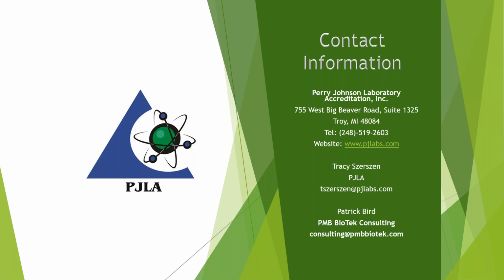AOAC is partnering with the National Institute of Standards and Technology, NIST, to create a wider range of PT samples, but they're focusing right now on the chemistry aspect of it more so than the microbiology. I also believe USP is investigating producing hemp PT samples as well, but I'm not sure if they're available on the market just yet.